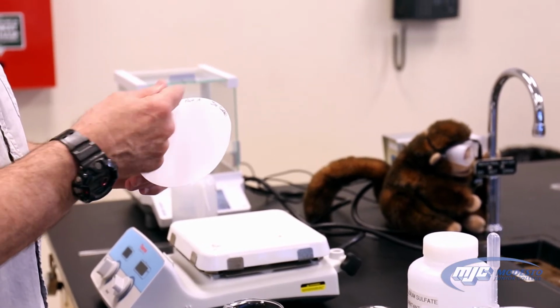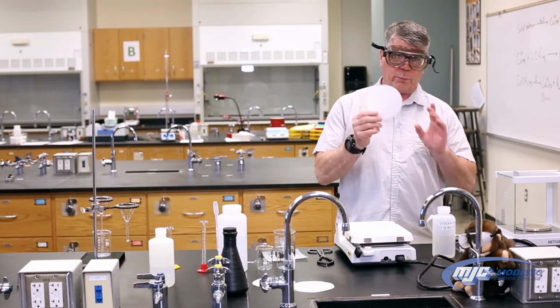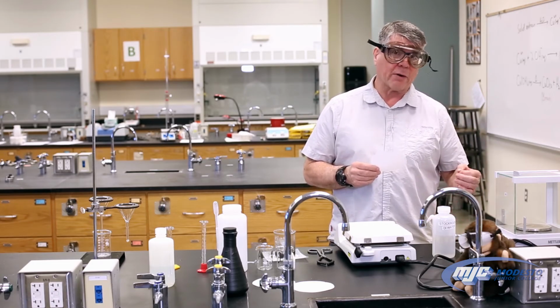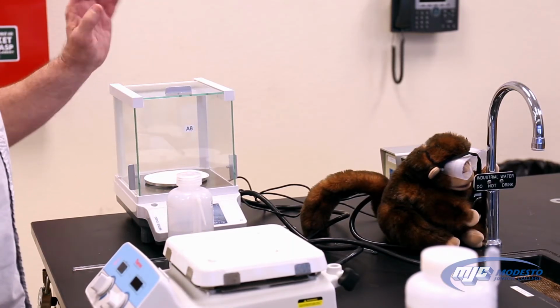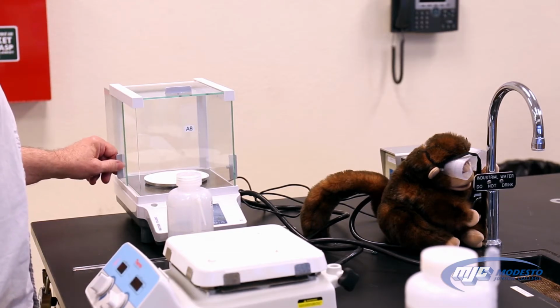So I also have a piece of filter paper, which I've labeled. It says copper two oxide part A and my name on it. We need to weigh this too, so I'm going to take this. Now, we want to know how much this weighs by itself, so be sure to make sure that the balance says zero before we place it on there. Close the doors. Write that number down in the data table. That's the mass of the filter paper for part A.